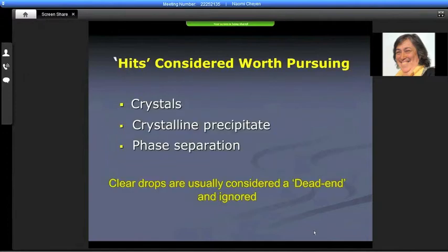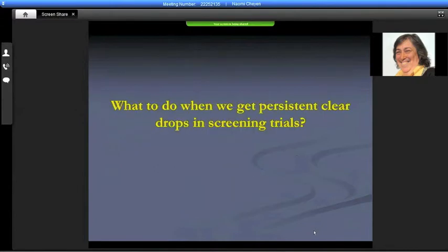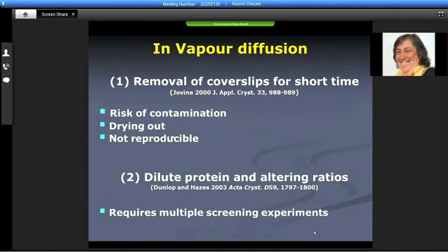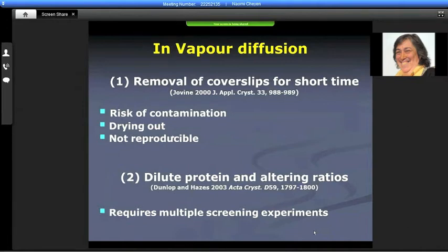When we screen, the hits that are considered worth pursuing are either crystals, crystalline precipitate, or even phase separation, but clear drops are usually considered as a dead end and they are ignored. So what do we do when we get persistent clear drops in screening trials? We don't want to throw them away. There were means people did ad hoc to remove the cover slip for a short time and then put it back, but mostly it was drying out and this was certainly not reproducible. There were other ways to alter the ratios of proteins, but all these require multiple screening experiments, and when one has a limited amount of protein you don't want to have to do it again.